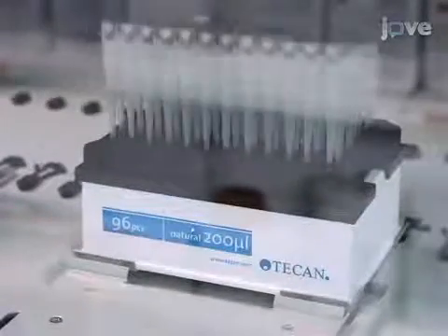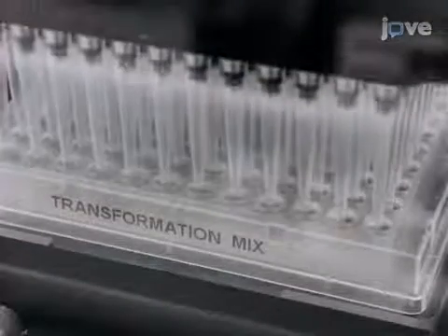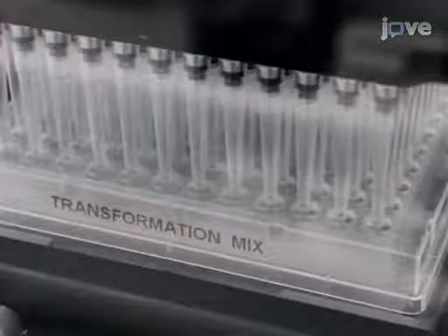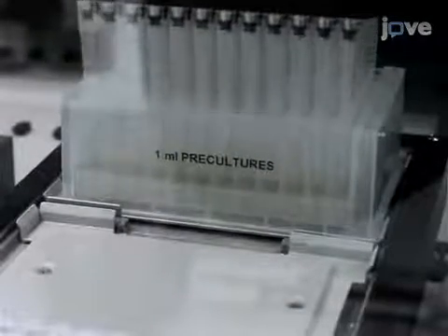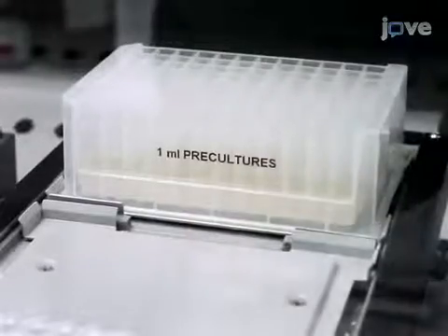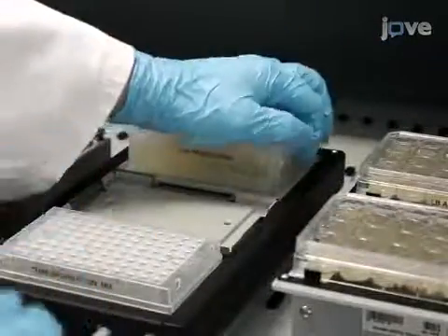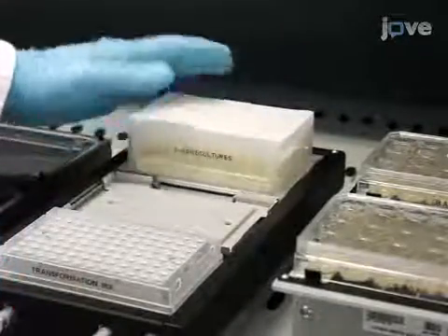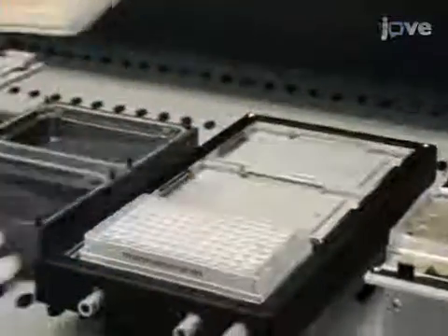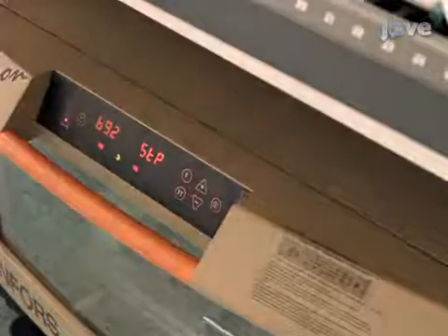After mixing, use the 96-multi-channel arm to aspirate 60 µL of the remaining transformation mix from the 96-well plate, and dispense the mix into a deep well 96-plate containing LB broth. Seal the deep well 96 precultures with breathable adhesive film to allow culture aeration, and then place the plate in a 37-degree Celsius shaking incubator at maximum speed overnight.